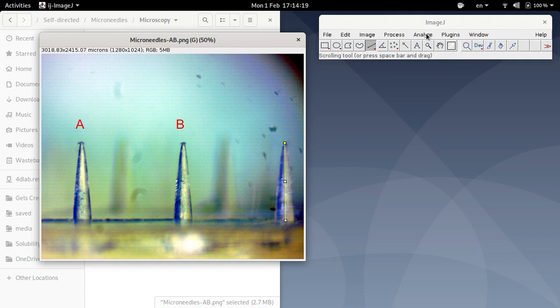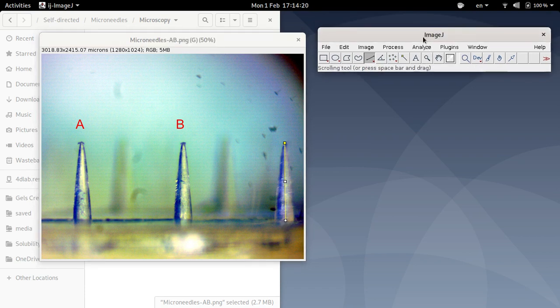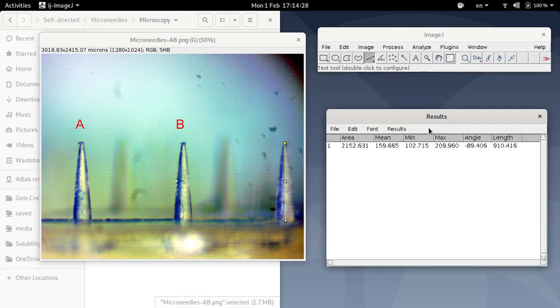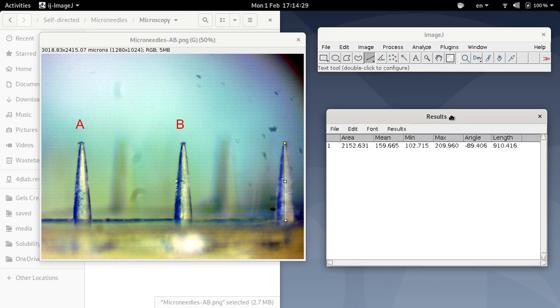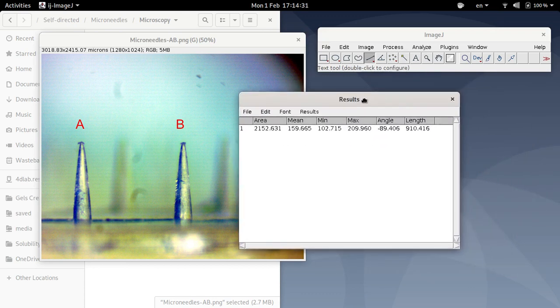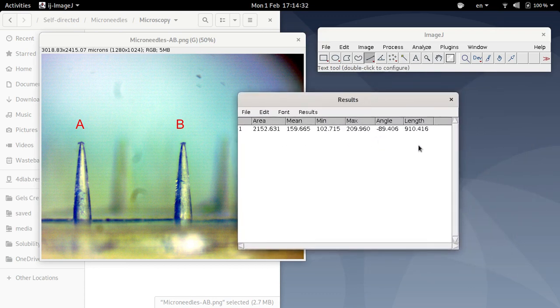To tell ImageJ to measure it, I go to analyze and click measure. You can also press Ctrl M on your keyboard. And ImageJ will then do the measurements. And in this case, it's determined that the length is 910 micron.